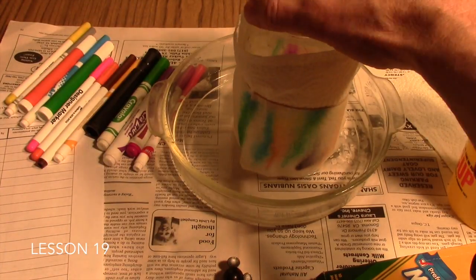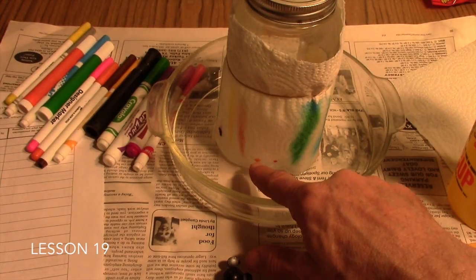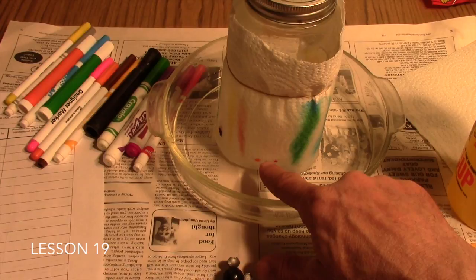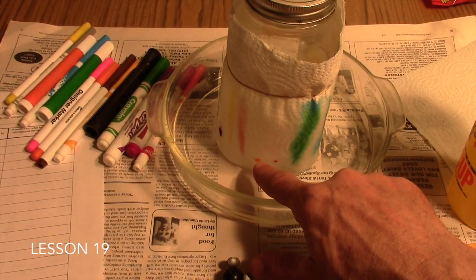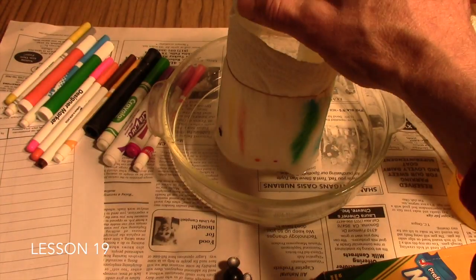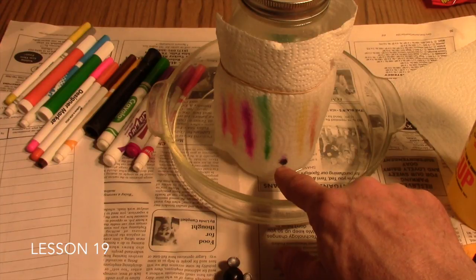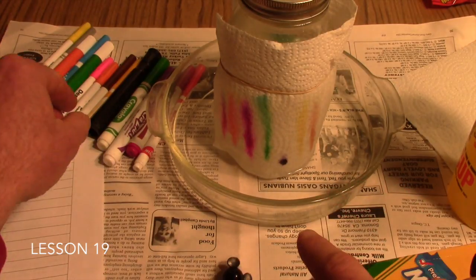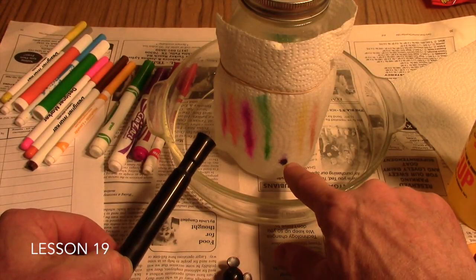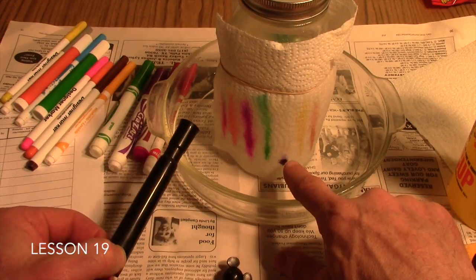Let's go back and look on the other side here. We still have these two spots right here that appears that nothing has happened. So you might ask your students, what do you suppose is going on here? Why aren't these inks separating like the others? And then we have one here. Now this was the spot that came from this black marker here, and you can see it doesn't appear to have much. It's got some separation, but not a whole lot.